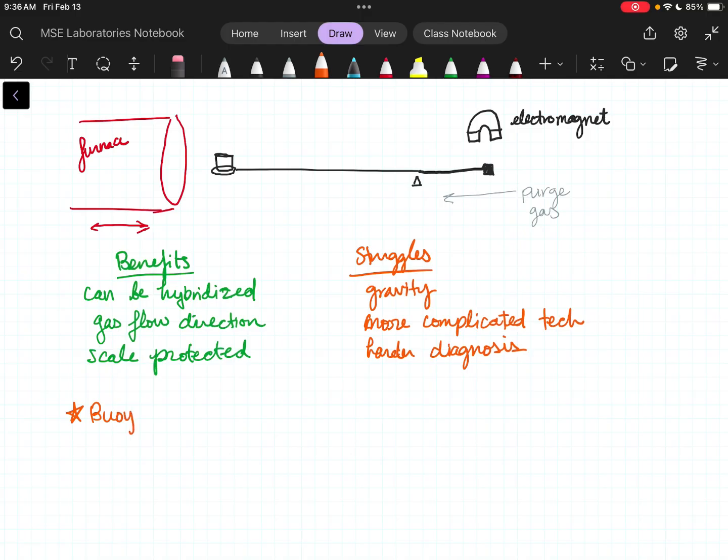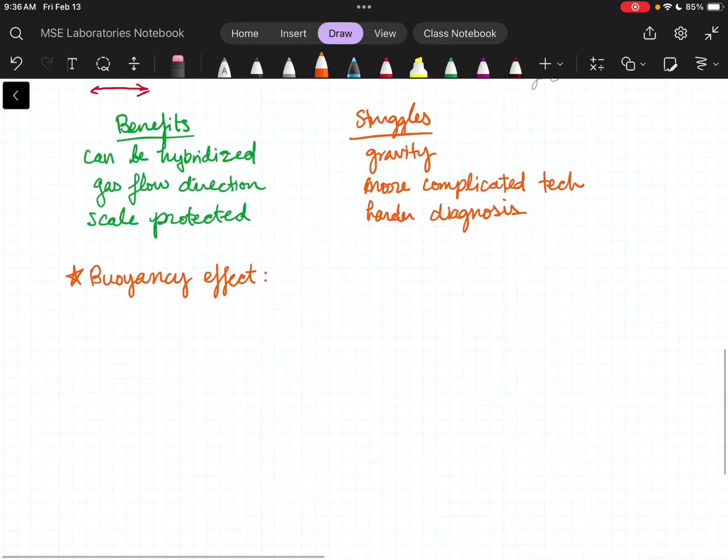It wouldn't be that hard to tune it, but painful. And it has all sorts of tuning capabilities on this backside over here as far as where is zero, where is horizontal. And that's part of replacing this beam, because try as they might, some of these beams are going to be a little bit heavier or a little bit lighter.